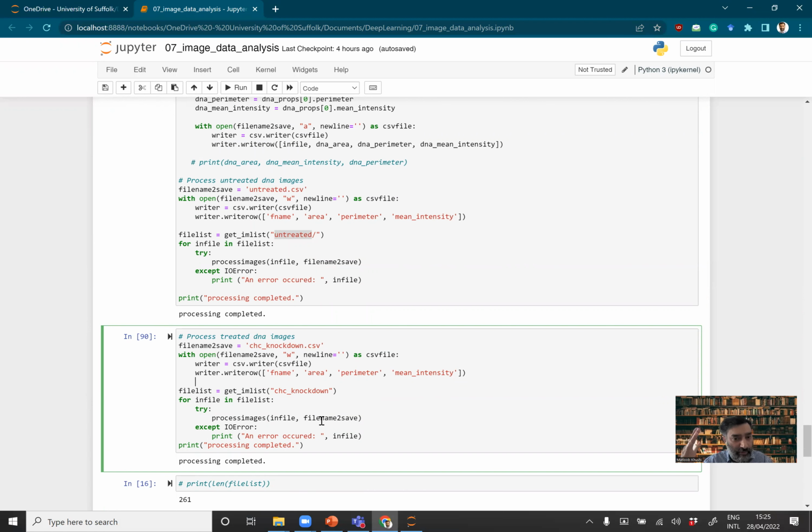Right, and now you have one big CSV file. You do the machine learning, deep learning, whatever you do, and you can also do statistical analysis, and that will allow you to quantify objects and also give meaningful information. You can show the efficacy of a drug or a treatment with some numbers, with some statistical analysis.